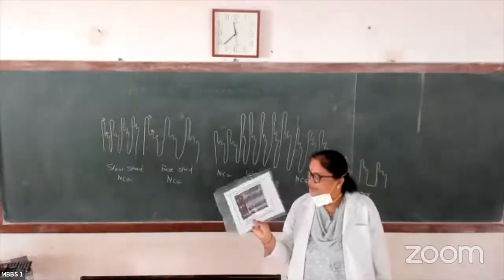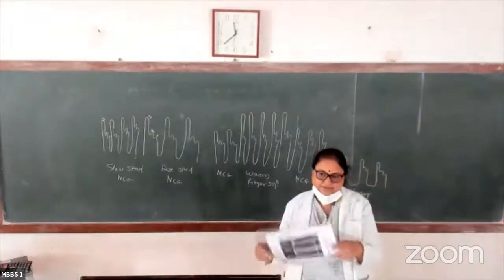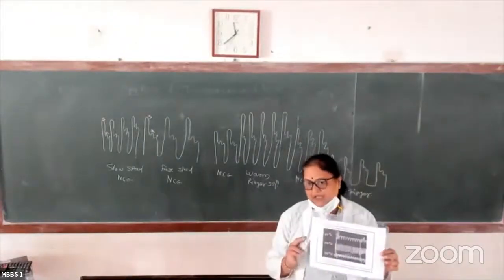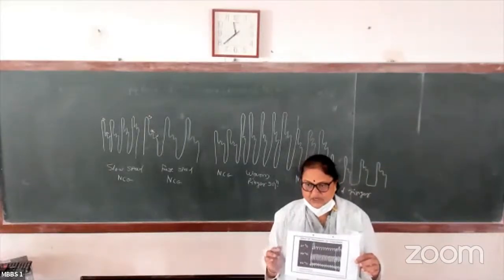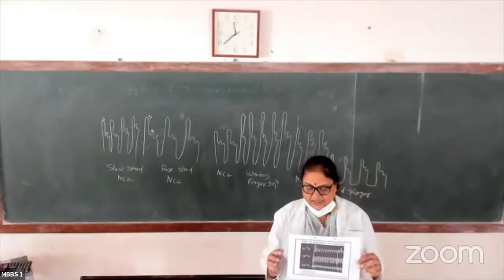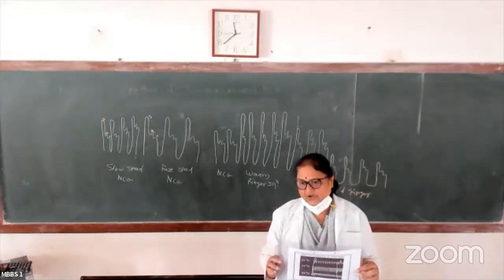Second, what is the effect of increased temperature on the frog's heart? Third question, what is the effect of decreased temperature on the frog's heart?